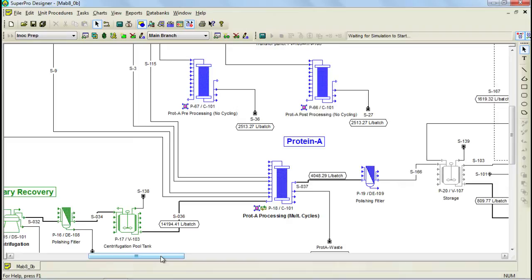When operating in cycles, it's important to recognize that the amount of cycles specified applies to all of the operations in the procedure. Therefore, if there are operations which you only do once — for example at the beginning and the end, such as pre-processing and post-processing operations — the only way to represent it is to have separate procedures that utilize the same equipment. For that reason, the columns in this model have been divided into 3 unit procedures.